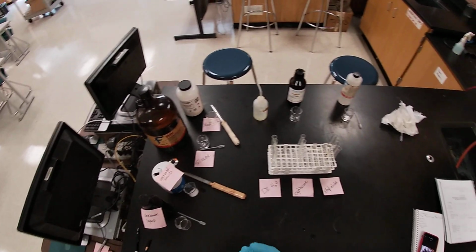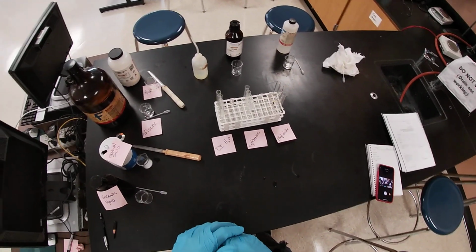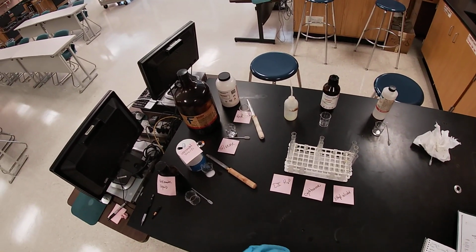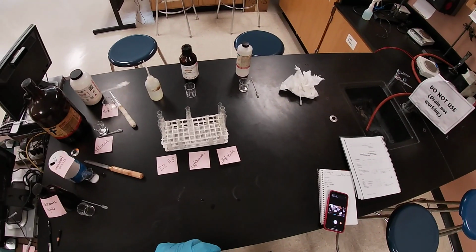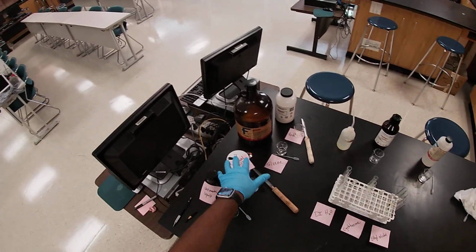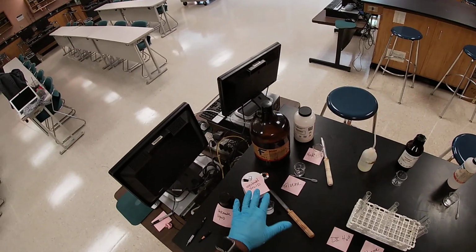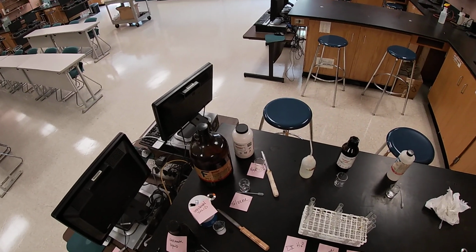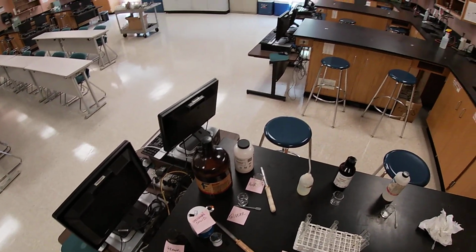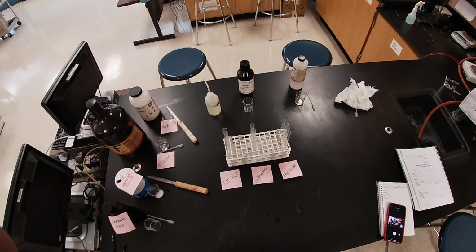We'll come back to it just to double check, see if something did change or not in about 15 minutes, okay? While we're waiting, we're going to work on the density of a solid, and then we'll also work on the density of the unknown liquid, okay? So once we figure out their solubilities of these two, we're going to compare them to what we know, and we're going to determine the possibilities of these based on solubility property and also their densities based on insoluble solvents, okay? All right, we'll come back.